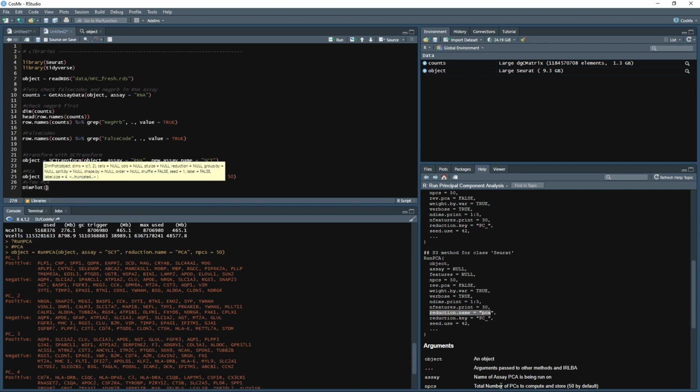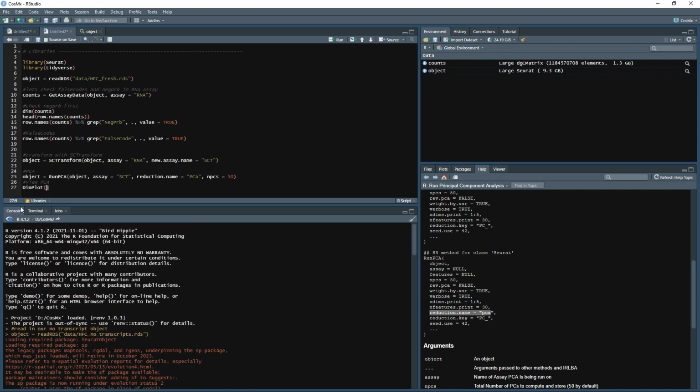And something that I've noticed with this version of R, 4.1.2, just like with my work one, is that leaving it on default when printing, unfortunately, does not yield any points. So this is something that I might have to put in an issue into GitHub for Seurat, which is really unfortunate.